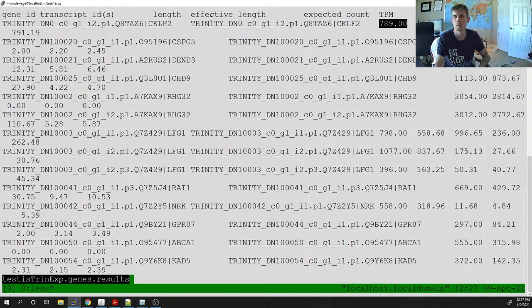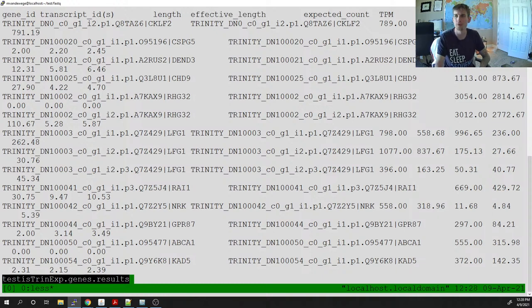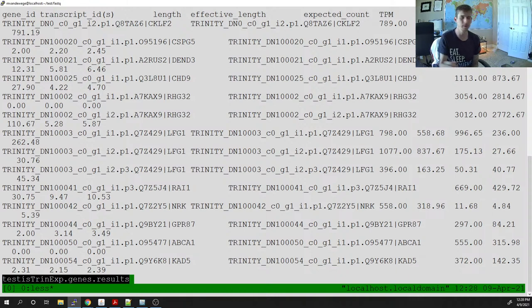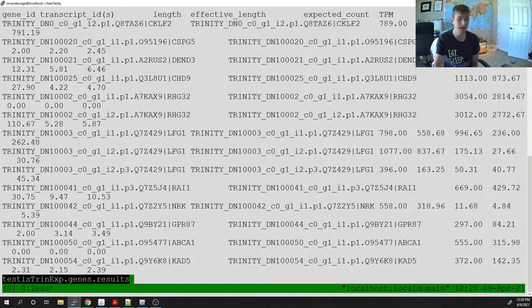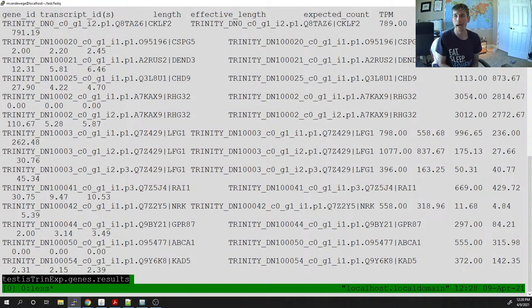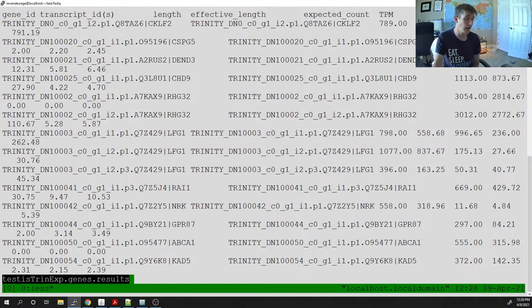The length in this case is 789 bases. The effective length is approximately how many bases had a read mapping to it — around 549. These two numbers aren't so important. The next three columns are more important: we have the expected count, which is approximately how many reads out of our library mapped to that specific gene — in this case it's 2,900. That raw read count is the most important number in this file.